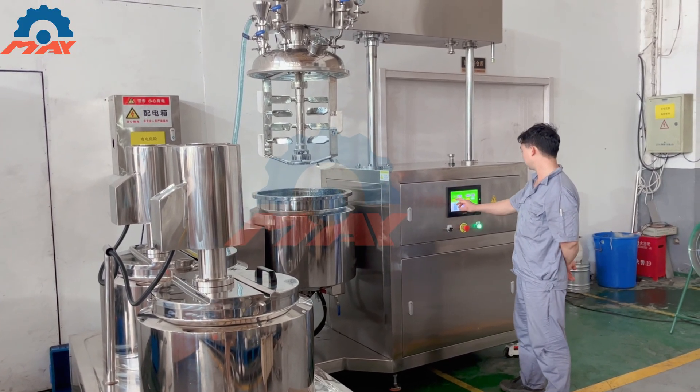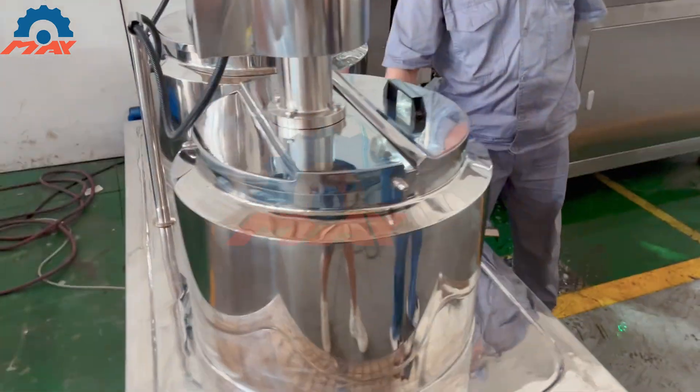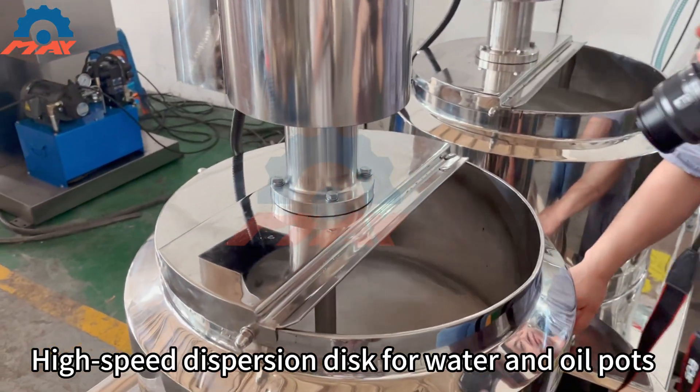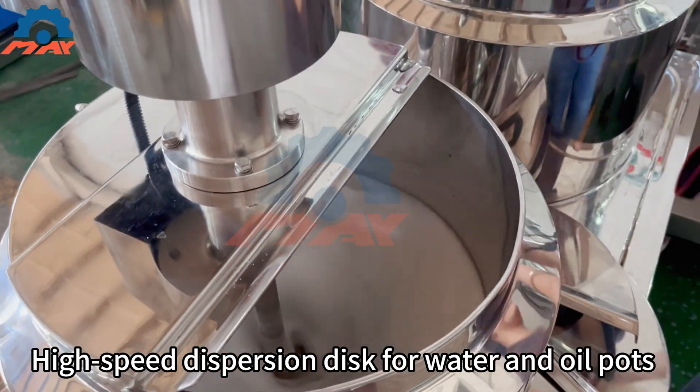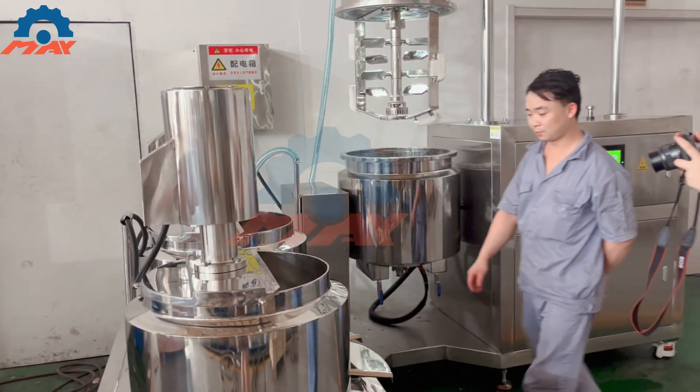Vacuum system to take out the air bubbles during mixing and to transfer the ingredients. Compressed air to discharge the finished cream. Tilting system for discharging finished product and easy cleaning. Multiple safety protection devices for vacuum.